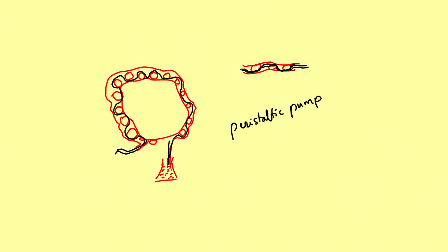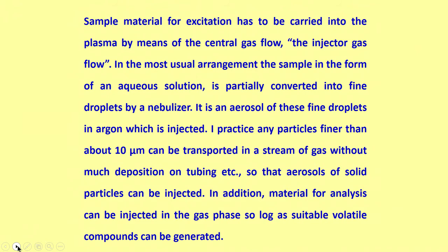A similar peristaltic pump is used in such systems, also in ICP AES, and that is how the sample is carried into the plasma.